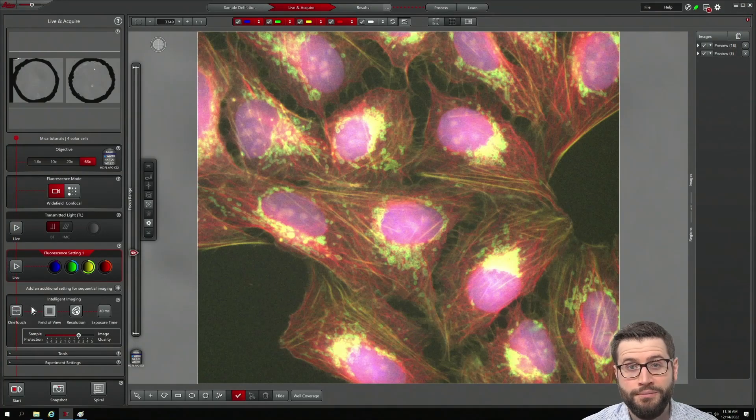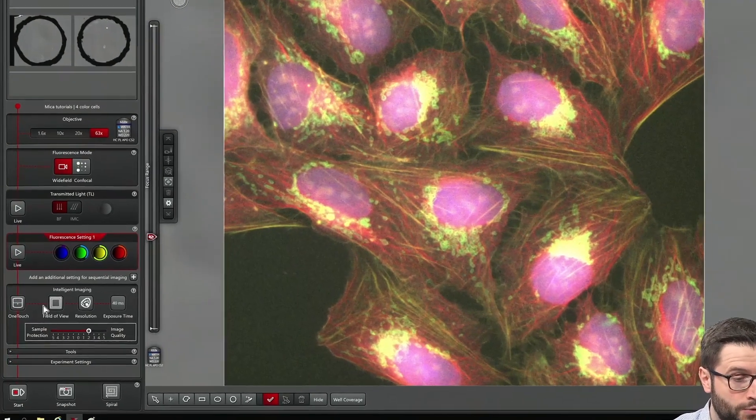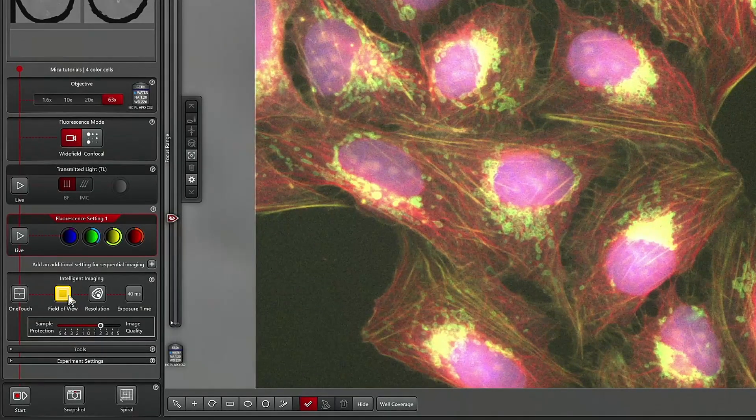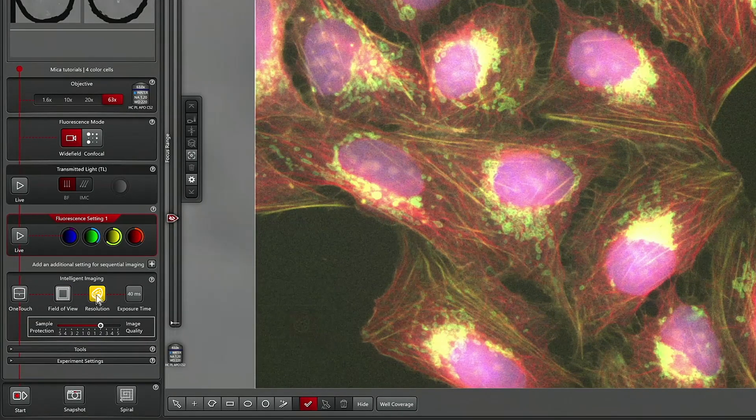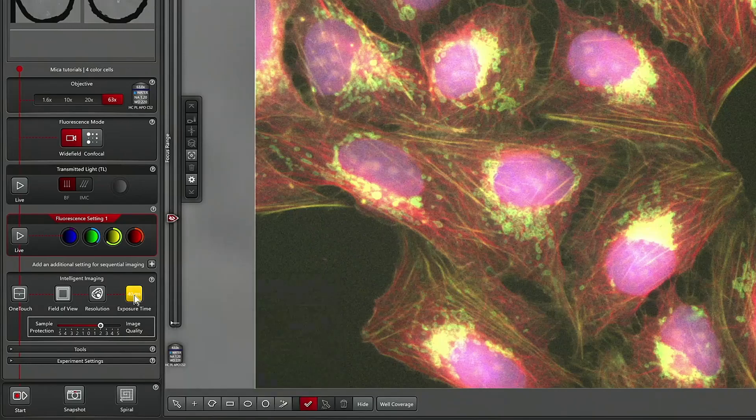Let's talk about intelligent imaging. Intelligent imaging allows you to control the field of view, resolution, and the exposure time of the images that you're recording.